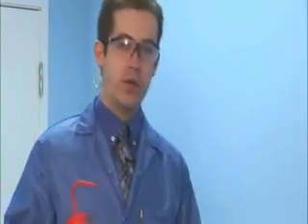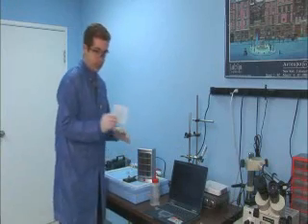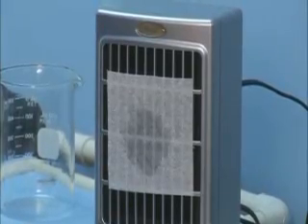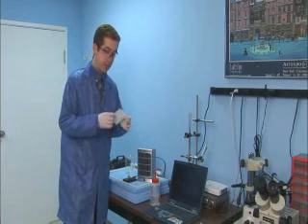This third experiment is a simple experiment that you can try at home. We will take a small napkin and some acetone. We will spray the acetone on the napkin, and then place this napkin on the front of the ChemStop. After about 15 seconds, we will remove the napkin from the ChemStop and smell it. There are no hints of any acetone on the napkin.